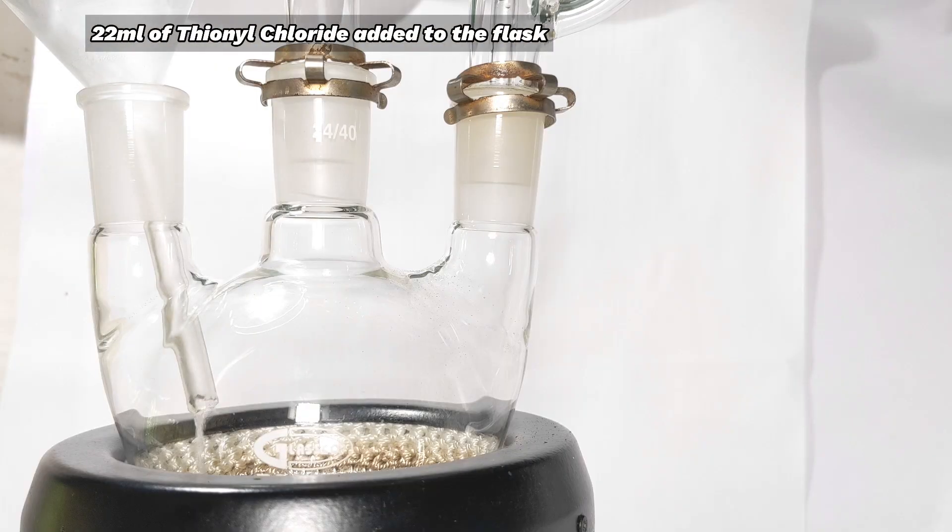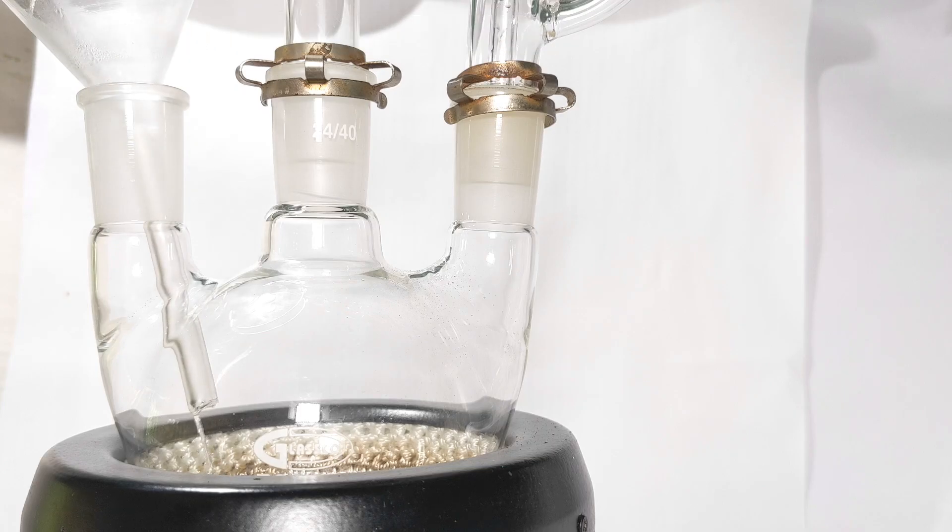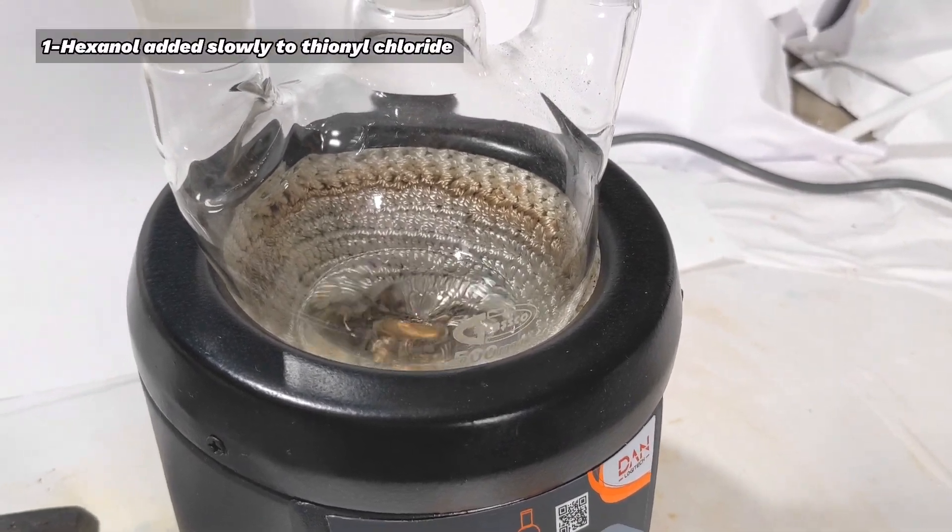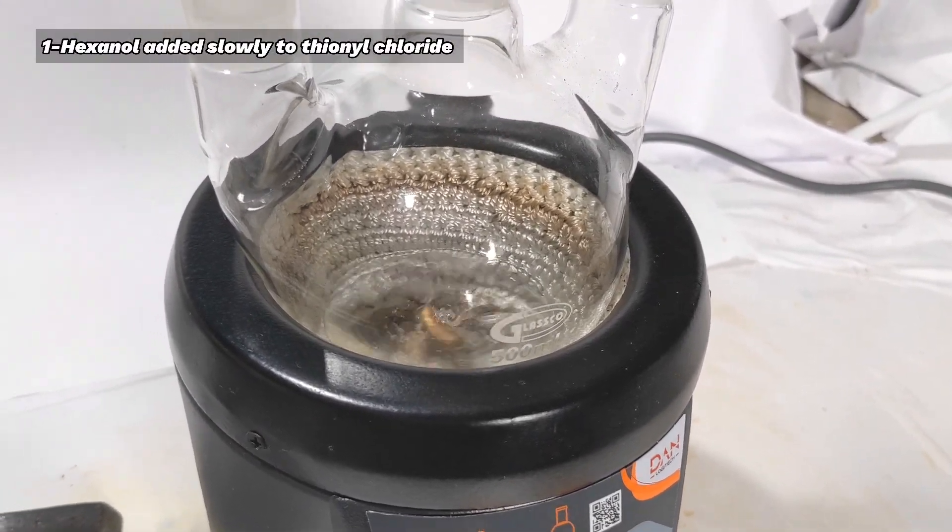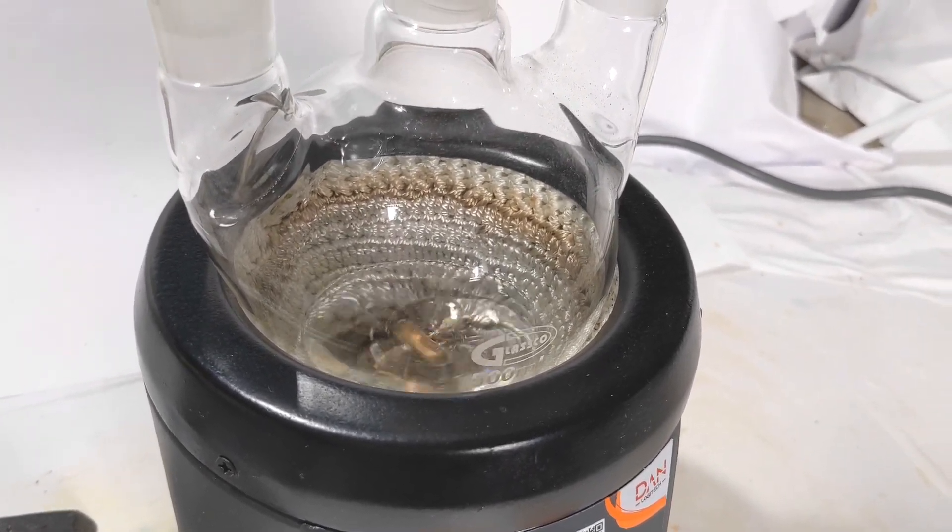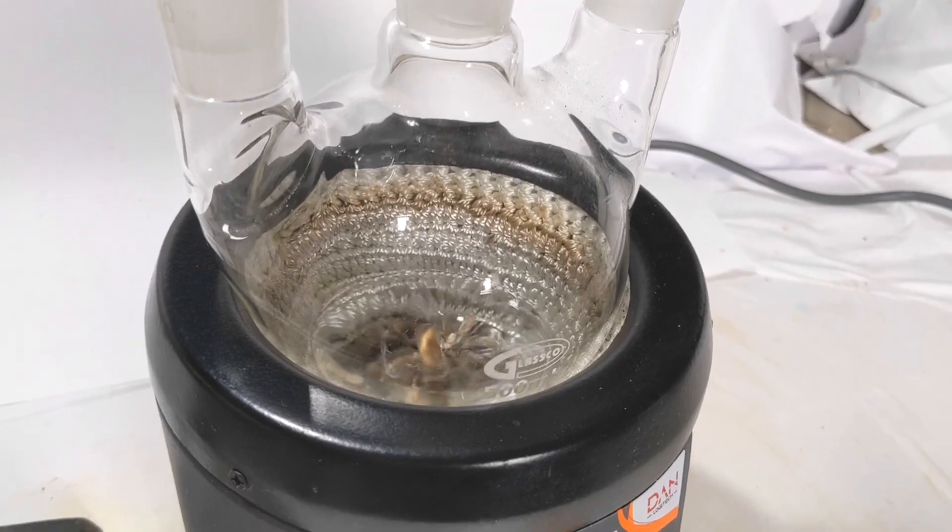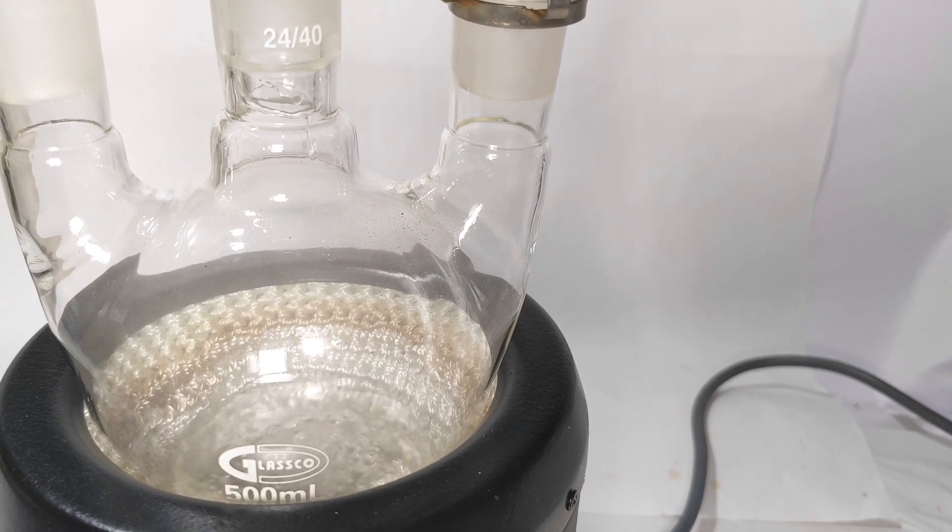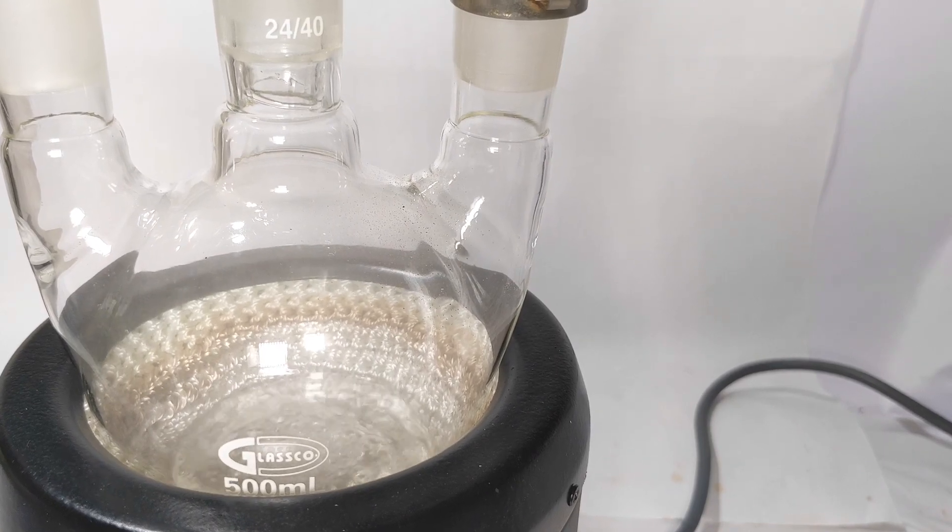22 ml of thionyl chloride was added to the round bottom flask and the side neck is stoppered. With the stirring turned on, 12.5 ml of 1-hexanol is added via the addition funnel. The addition of 1-hexanol to the thionyl chloride is exothermic, so be careful with the addition and go slowly.